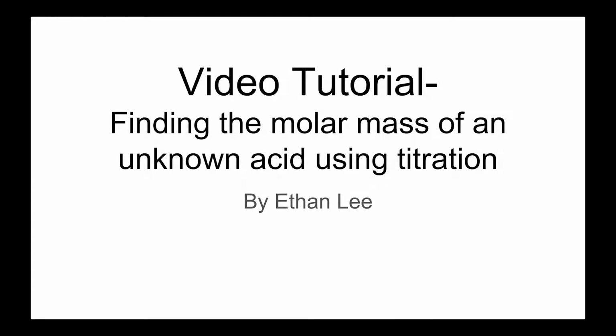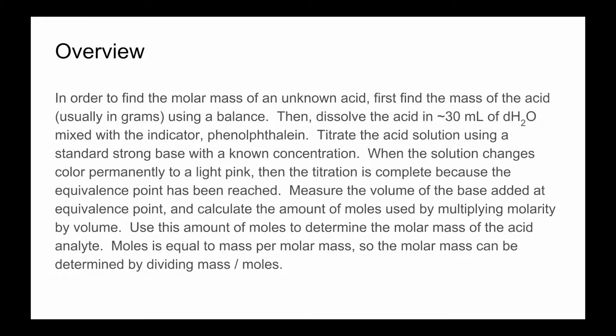Hello, this is a video tutorial on finding the molar mass of an unknown acid using titration. In order to find the molar mass of an unknown acid, we must first use the titration method.